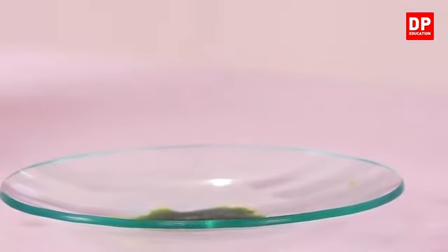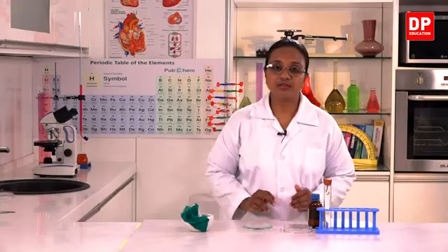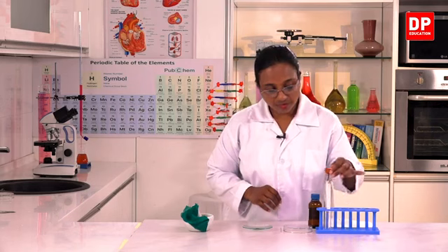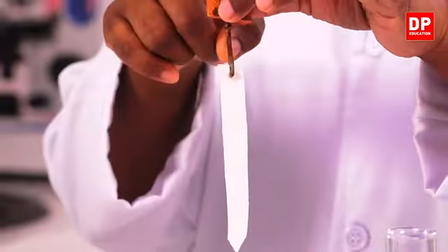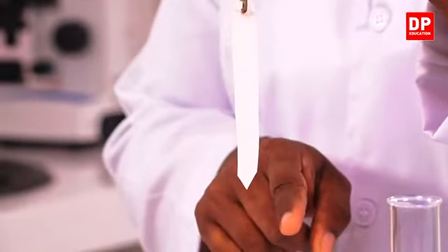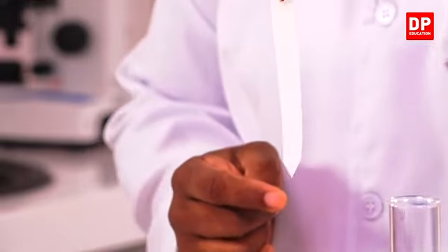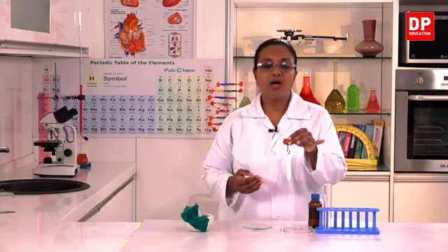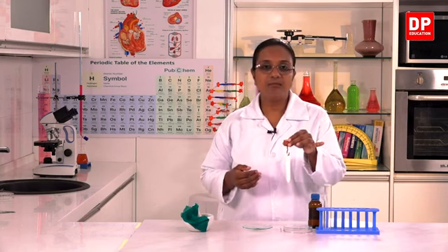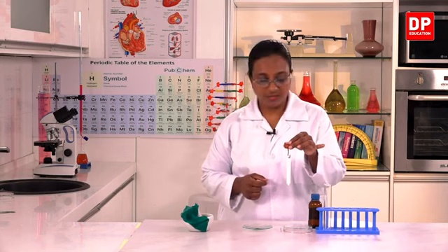From this extract, I have to make a spot on the chromatography paper. You know what a chromatography paper is. I have got it ready here. You can see it's connected to a cork and you can see the shape of the chromatography paper. Here it has a sharp point, and for this purpose there are chromatography papers available in the market, or we can use a blotting paper, or even the filter paper can be used.